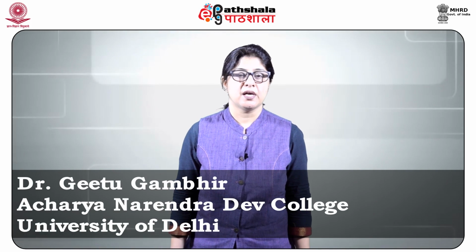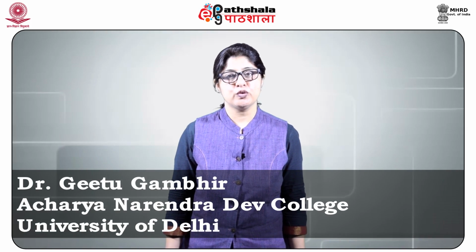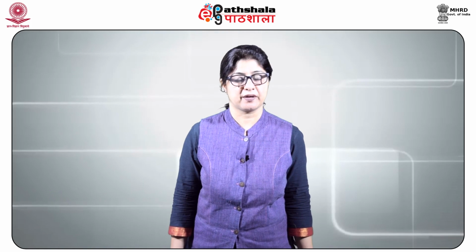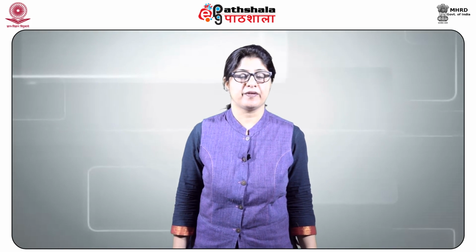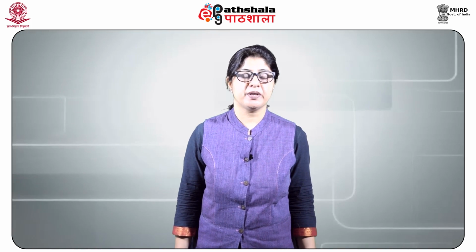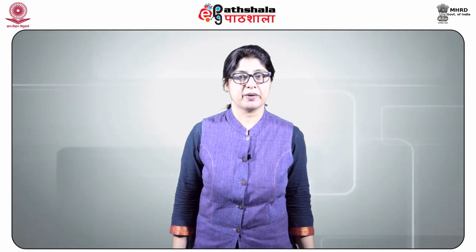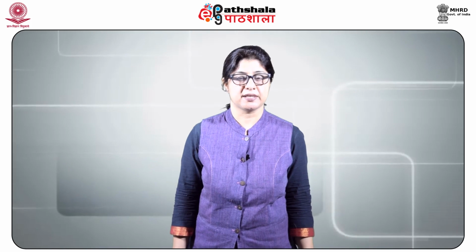Dear students, after studying this module, you shall be able to know about liquid chromatography and high performance liquid chromatography, the principles of HPLC, instrumentation and their working, application of liquid chromatography and HPLC.